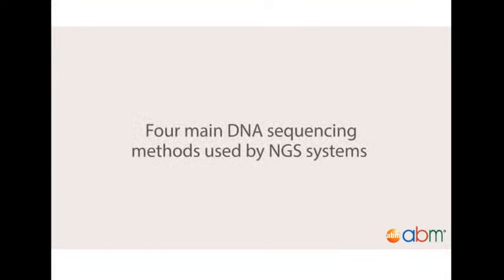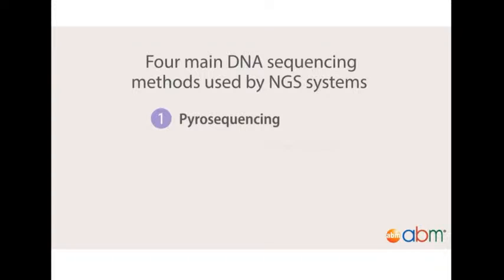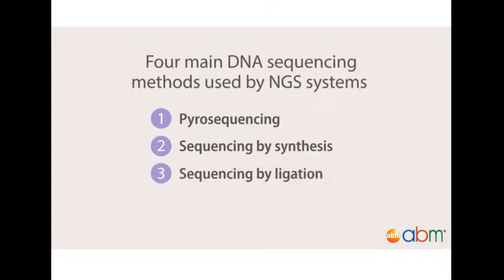The differences between the different next-generation sequencing platforms lie mainly in the technical details of the sequencing reaction, and can be categorized in four groups: pyrosequencing, sequencing by synthesis, sequencing by ligation, and ion semiconductor sequencing.